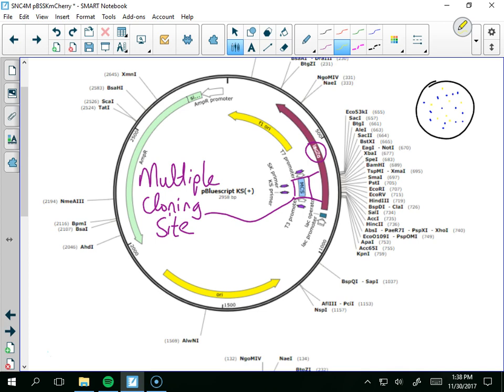Ampicillin. Okay? So we're growing our bacteria, and in the bacterial dish is this antibiotic called ampicillin. Now, without ampicillin, any bacteria will grow, which means that whole dish would be covered. And you'd see blue splotches, a mix of blue and yellow. They're kind of an off-white, sort of a pussy color. That's what the colonies look like when they grow, all right? Sort of gross almost. Not that gross. I mean, there's grosser things. But without the ampicillin, this plate would be totally covered in what they call a lawn.